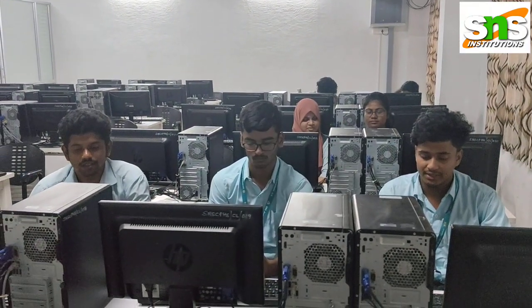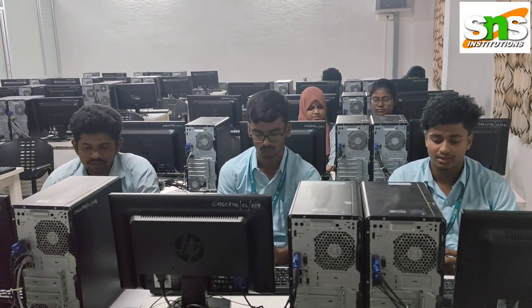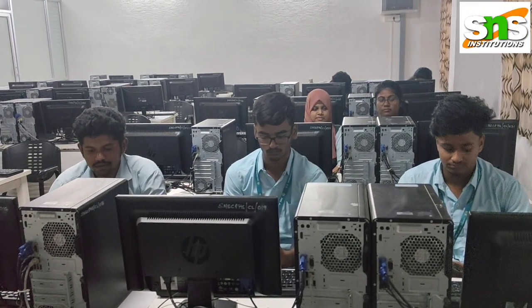Which type of light is commonly used in a colorimeter? Option A, ultraviolet light. Option B, infrared light. Option C, visible light. Option D, X-rays. Let me answer option C, visible light.